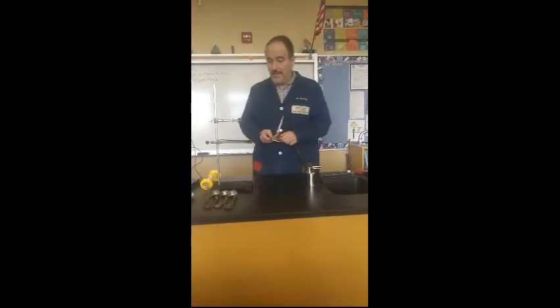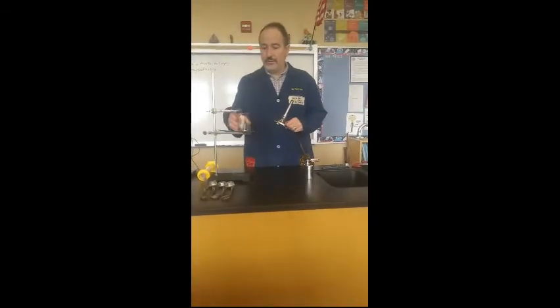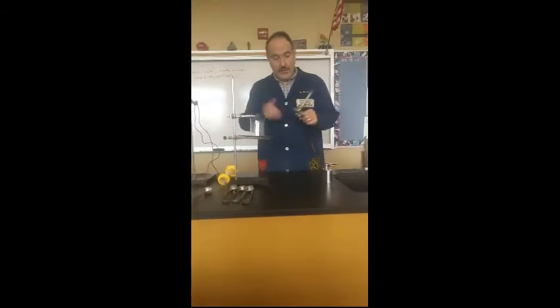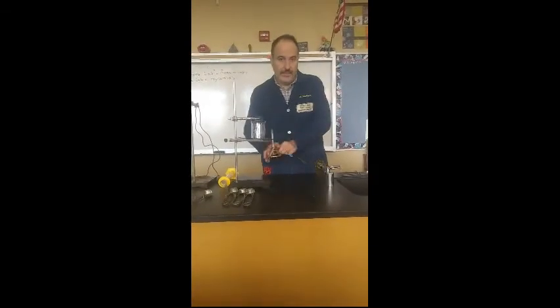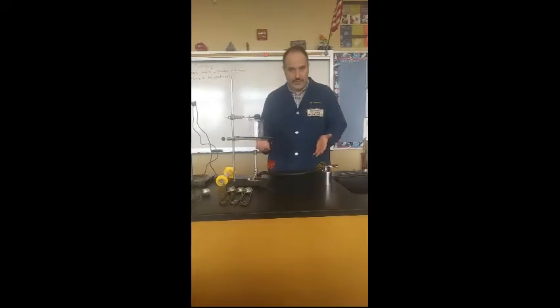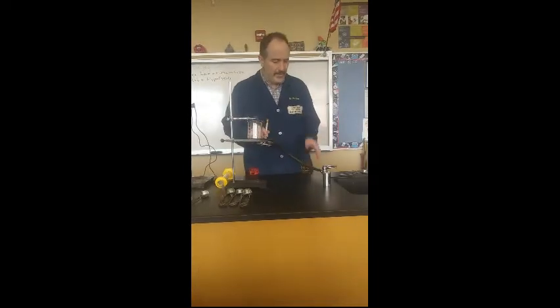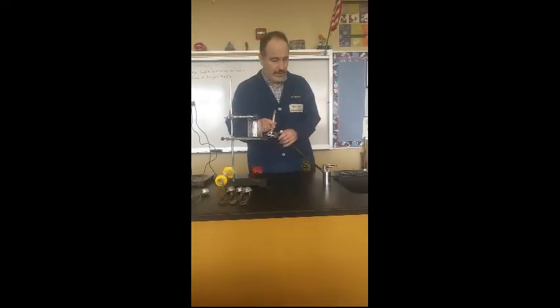Because what you do is if you have an apparatus that you're going to be heating up, let's say a beaker of water or something like that, you want to make sure that you light this away from it and then move it underneath once you have it fully adjusted. So when you're moving it, you don't want the hose to accidentally pop off. So just give a little tug, make sure it's good. All right.